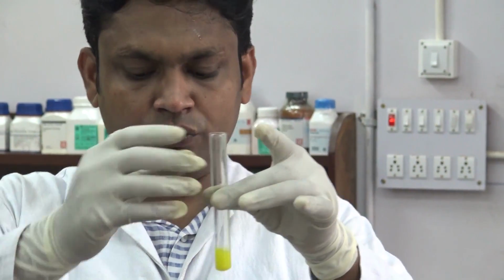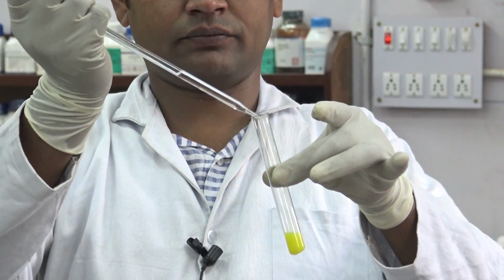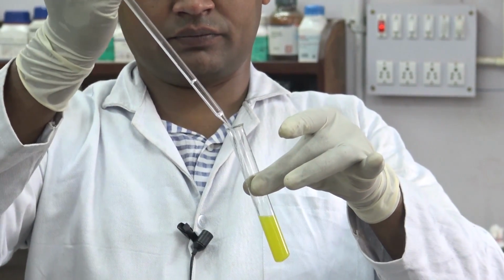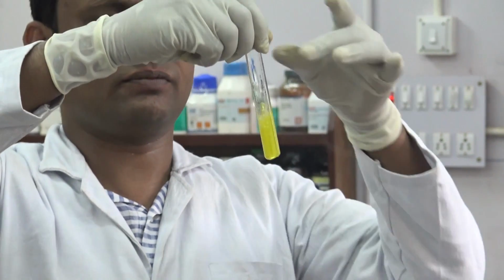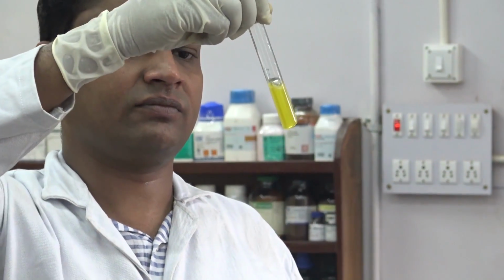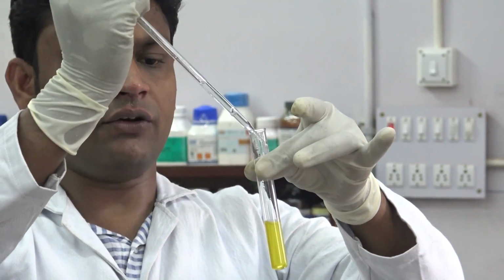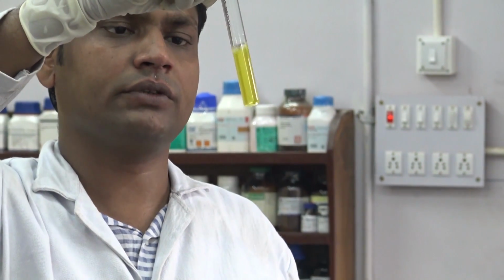In one part, we will add dilute nitric acid, and we can see that the yellow precipitate is soluble in dilute nitric acid, and the solution becomes clear.